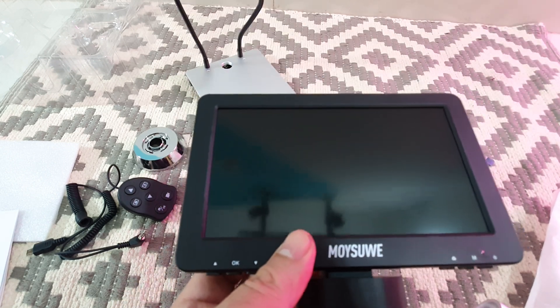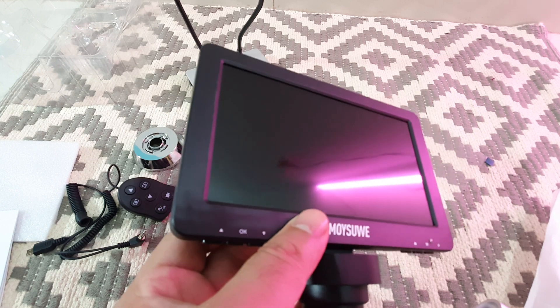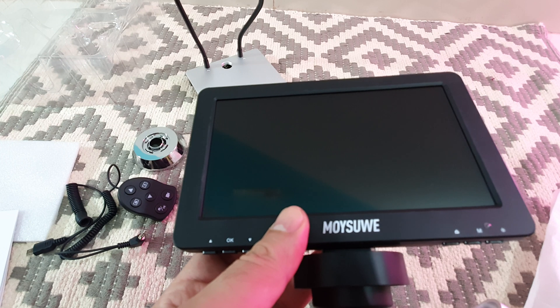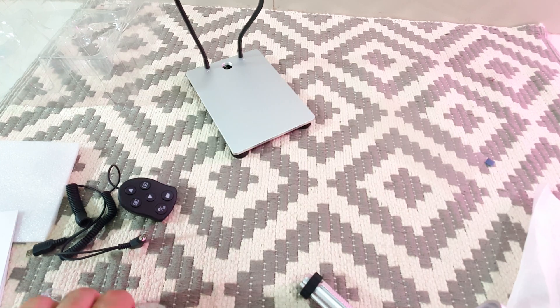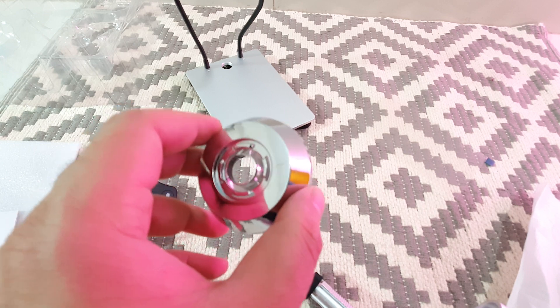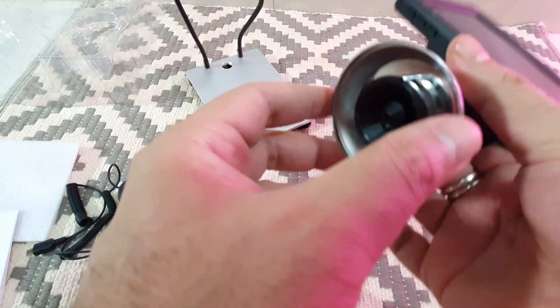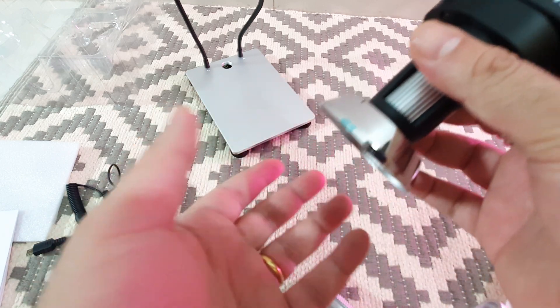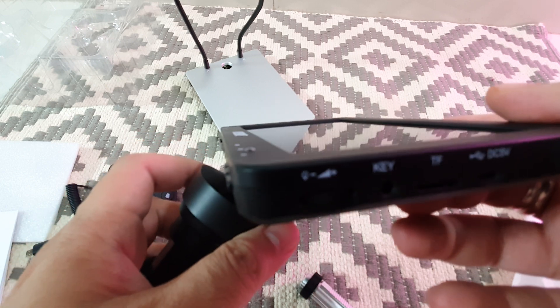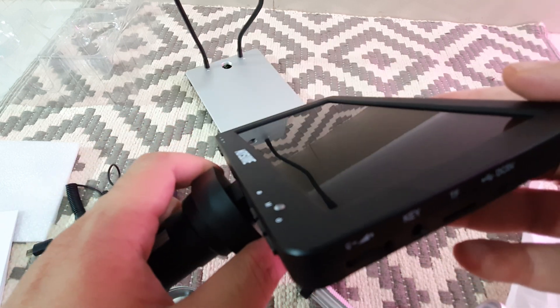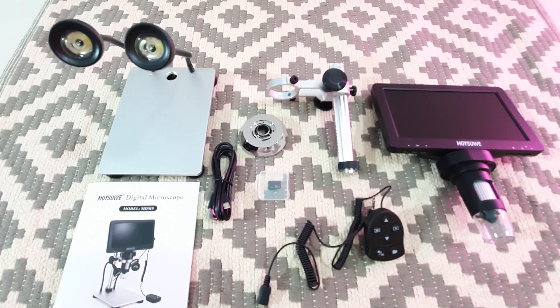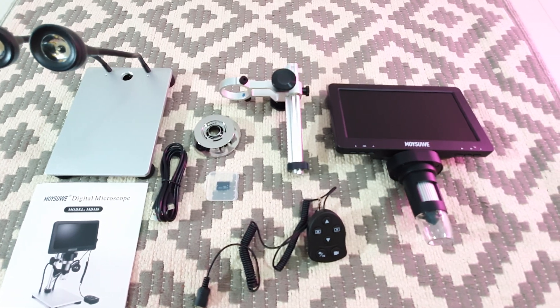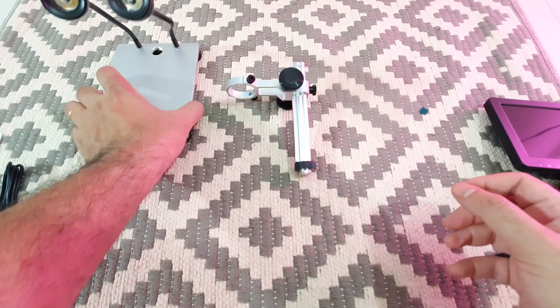Removing the protective screen from this. It's a semi-gloss display. When I read the manual it says that it's used for soldering purposes to avoid reflections of some sort. Not too sure, but you can take off the plastic unit from the tip of this microscope and add this unit so that it actually helps you have lesser reflections from when you're soldering. And this is the tilt I was talking about, the screen is tiltable which makes it easier for you to see. Here are the items you get in the box.